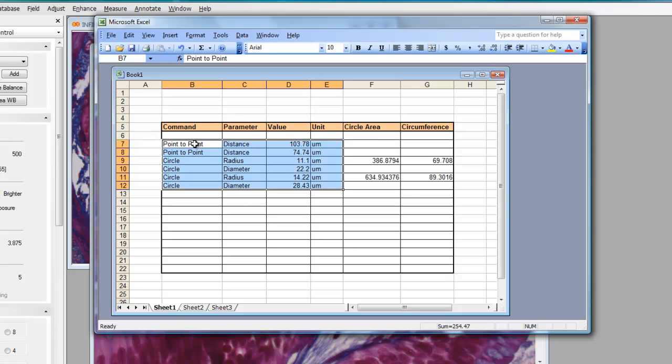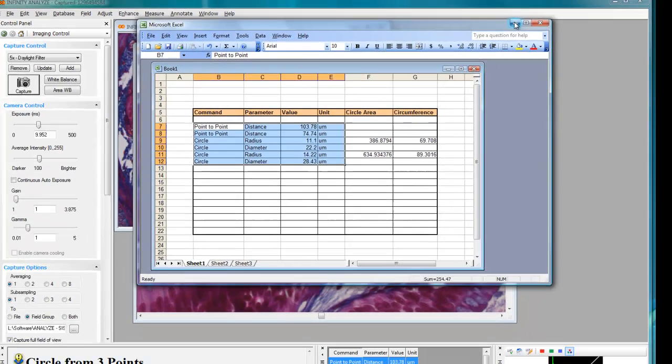And if you have any other calculations set up, for example in this space here we have an area and a circumference for any field that's listed as a radius. This indicates how you can use a spreadsheet to enhance the calculations and analysis that you do on your measurement data. I'm going to minimize this window now and go back to my measurements.